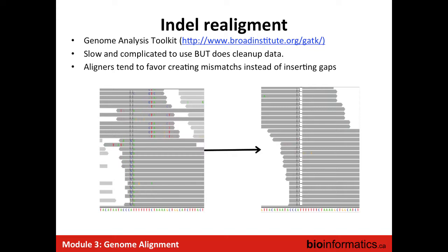So why do we need to do that? Here is an example of indel realignment. You have your reads as they look after alignment, and you see that in this region you accumulate many possible mismatches with your reference, all the colored bases, as we saw this morning with Florence. When you see that, you probably say, "Oh, I've got some issue in my reads, because I don't expect to have so many variants. I expect a variant around every kilobase. I don't expect five or six variants in 10 or 15 base pairs."